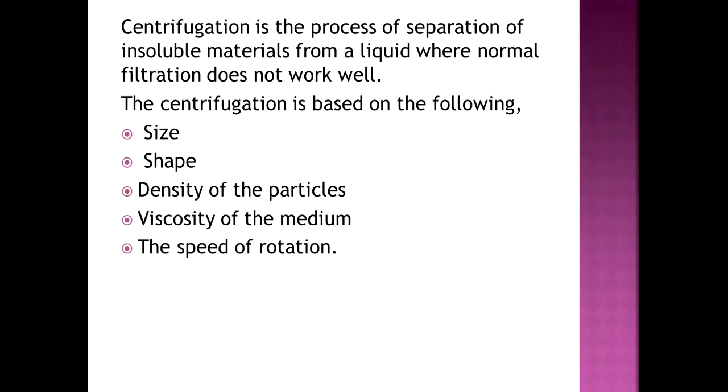Centrifugation is the process of separation of insoluble materials from a liquid where normal filtration does not work well. This is the basic principle. Now we look at the process of filtration using a filter paper. You observe that you're separating solid from liquid particles.